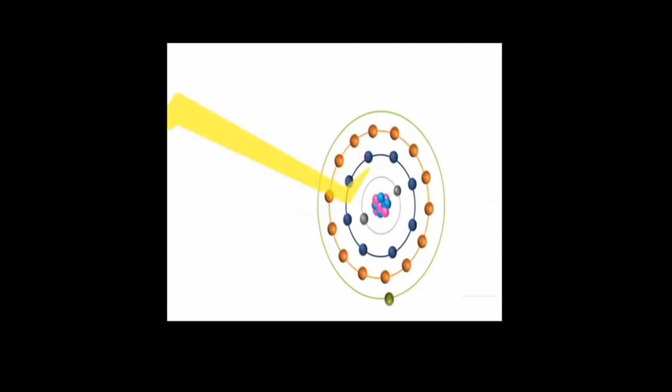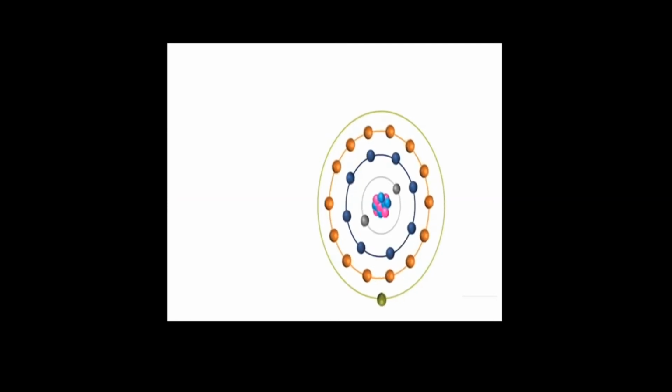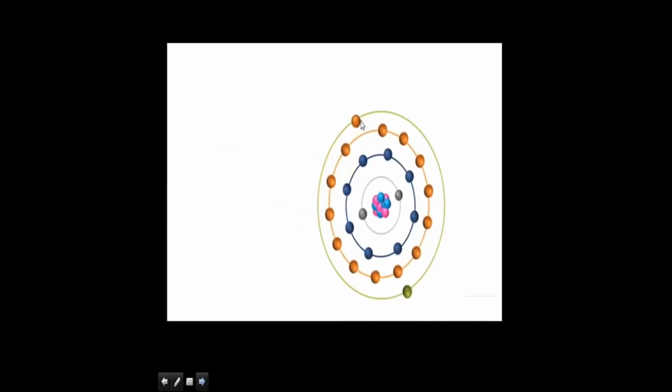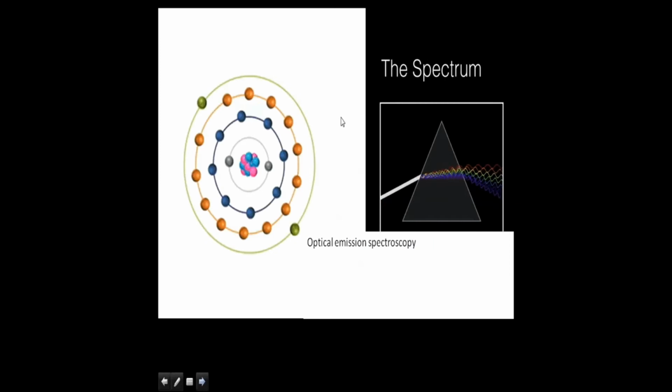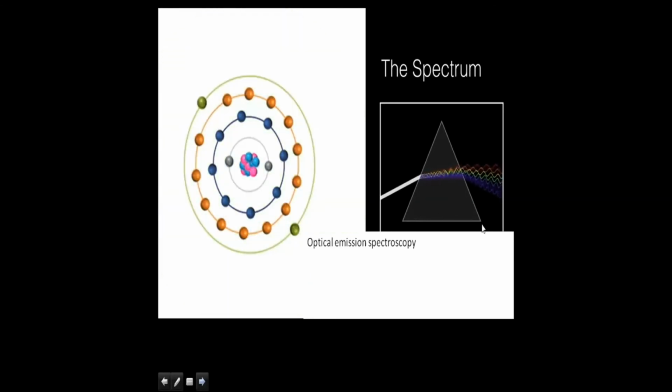It breaks the chemical bonds to create free atoms at the sample interface without actually penetrating through the surface. It also excites atoms to an excited energy state, which subsequently emit light while returning to the ground atomic state or lower energy state. This light has a particular wavelength or frequency determined by the energy of the electron in transition.